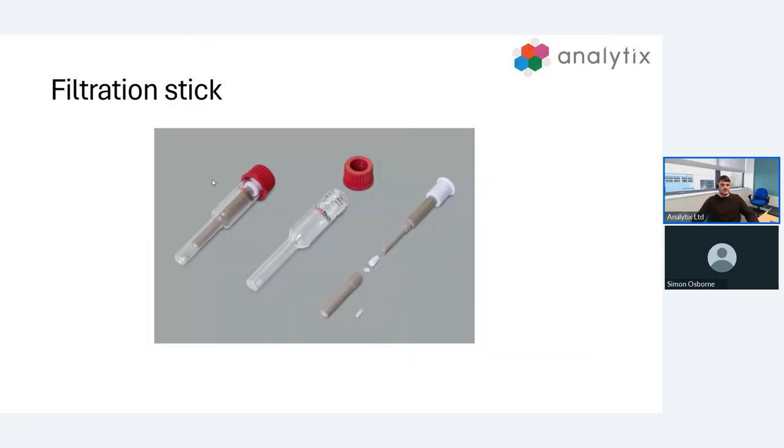Here's our filtration stick. This makes filtrations a lot easier. After you complete the reaction, we simply draw up via this filtration stick and we will take the liquid phase and leave any solid particulates behind in the vial for cleaning.